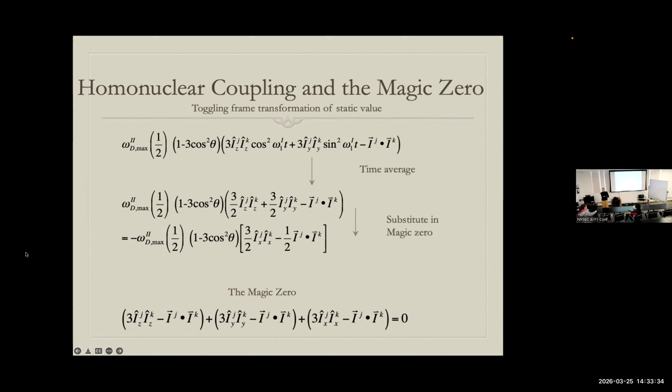Couple things about it. One is that the bad actors here are geminal protons with couplings of 40 kilohertz. And so we should not be using the small angle approximation anyway, because a half or a quarter of a rotor cycle is not short. A half or a quarter of the B1 cycle is not short. And what about your question? The B1 cycle and the magic angle are on the same order of magnitude. How do we know that they don't act as a rectifier or bridging effect? There are all sorts of worries with what we've done here, and we don't have the MAS there yet. So let's just talk about the B1.